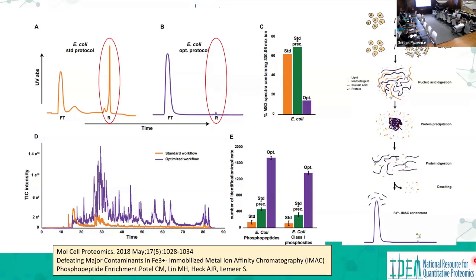There's a method that Dennis talked about that the people in the sample prep lab don't like, the FASP or filter aided sample prep method, where we're spinning samples through a 30 kilodalton membrane. That method always generated pretty good phosphopeptide data. If you did a solution digest of the same sample, it just wasn't as good. Didn't make any sense. Except now the intact DNA is held above the membrane, and after digestion, the peptides come through. And so you are separating the DNA from the protein, not really intentionally.